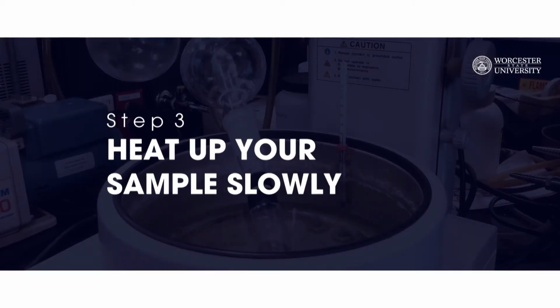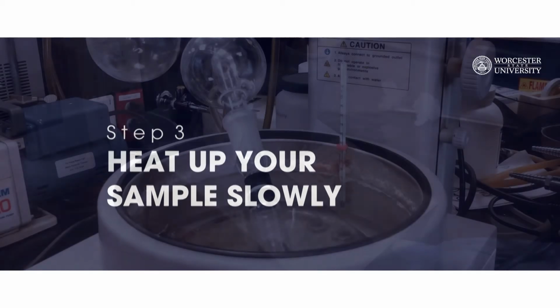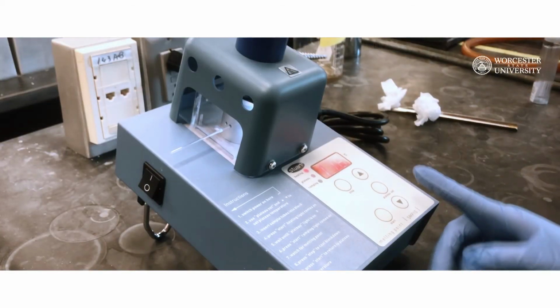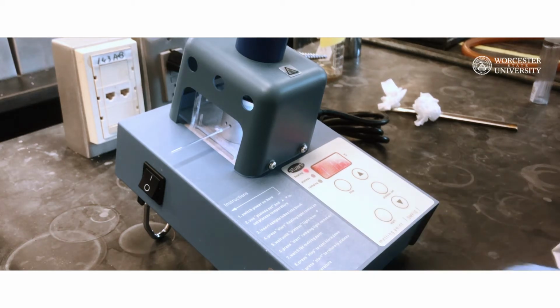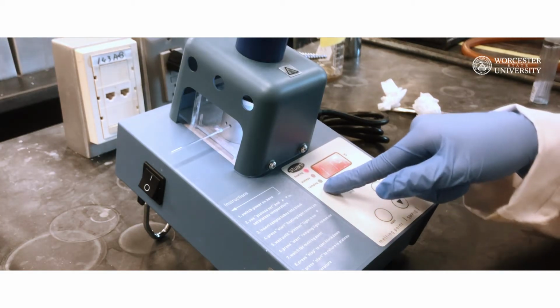Step 3. Heat up your sample very slowly. After the apparatus reaches the plateau temperature, it will stop heating. You will have to press the start button again. Otherwise, the apparatus will just stop at the plateau temperature. Now the apparatus will start heating at a much slower rate, around 2 degrees Celsius per minute. The ramping light will be lit up as well.